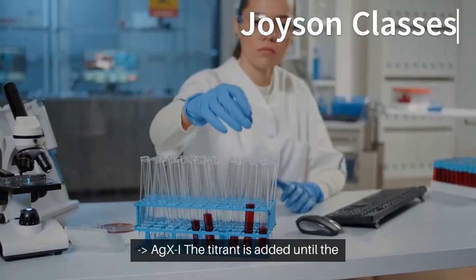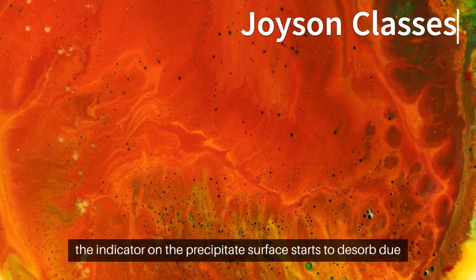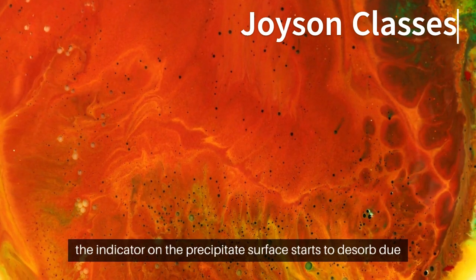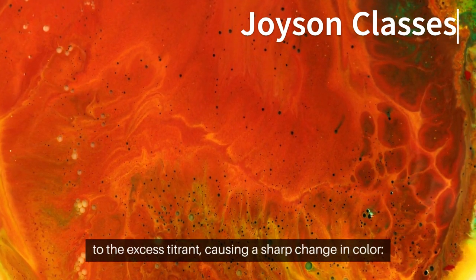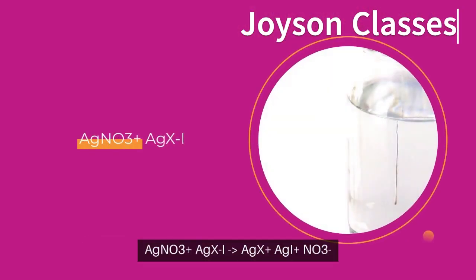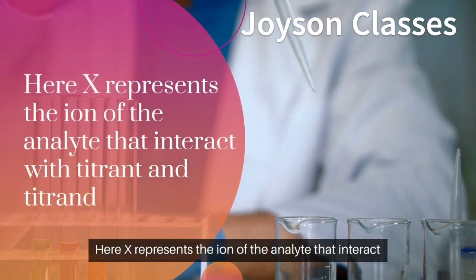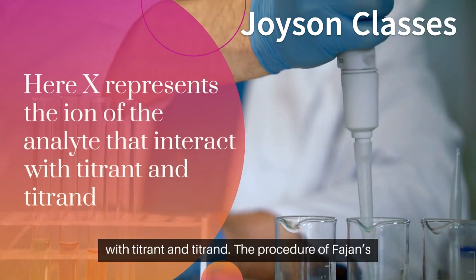The titrant is added until the equivalence point is reached. At the equivalence point, the indicator on the precipitate surface starts to desorb due to the excess titrant, causing a sharp change in color. AgNO3 + AgXI → AgX + AgI + NO3⁻. Here X represents the ion of the analyte that interacts with the titrant and titrand.